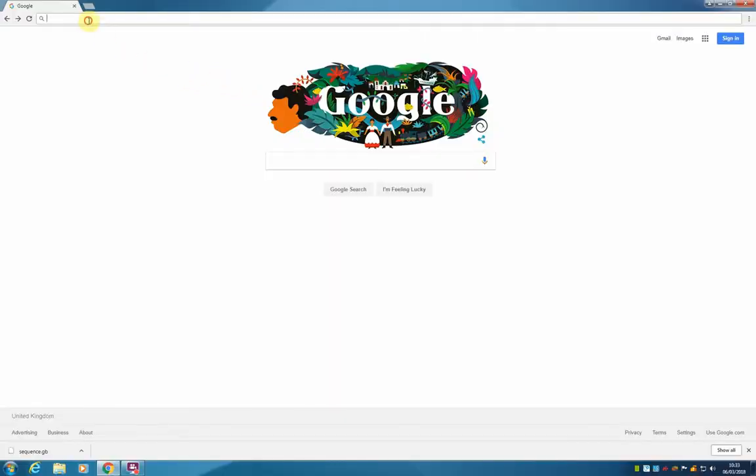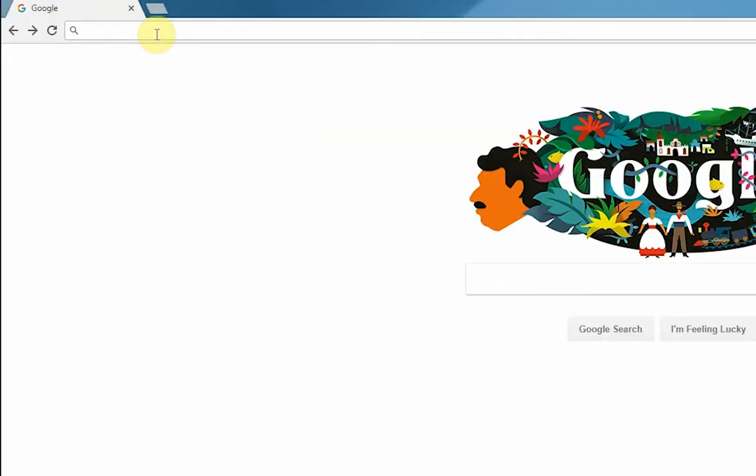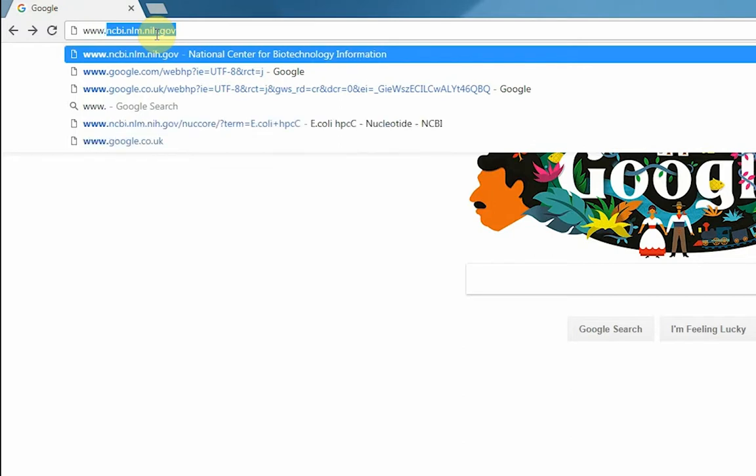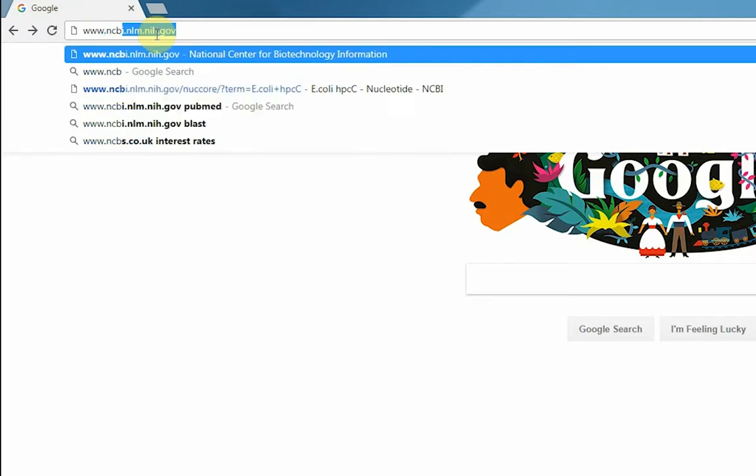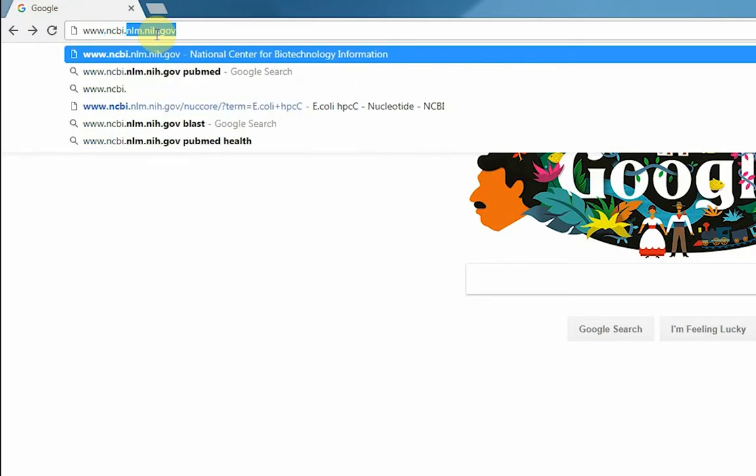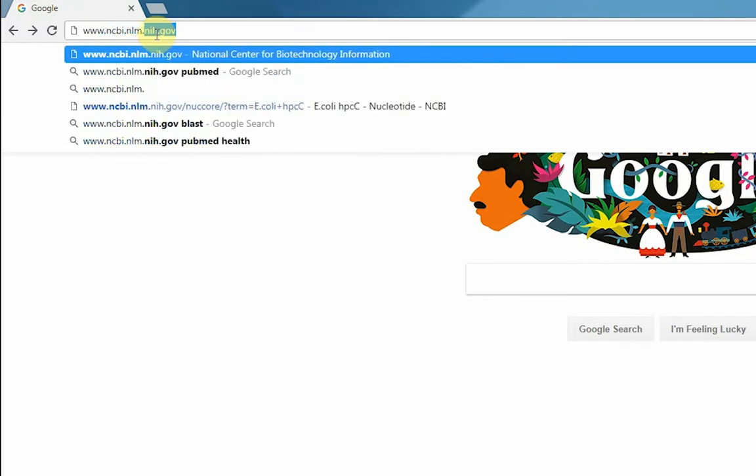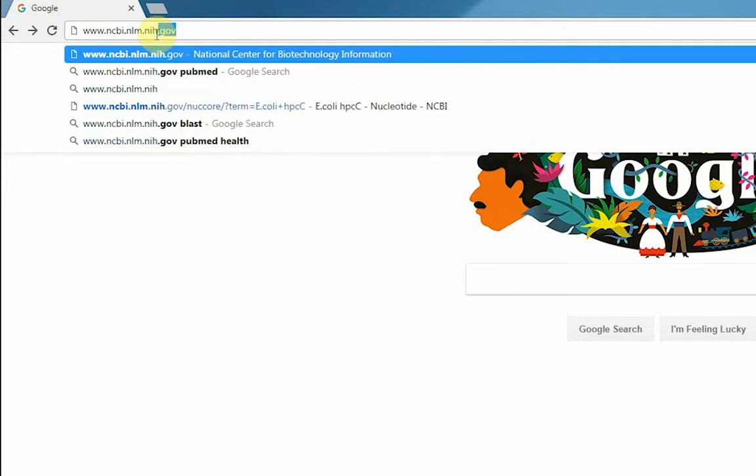First we are going to start by navigating to NCBI by typing www.ncbi.nlm.nih.gov.